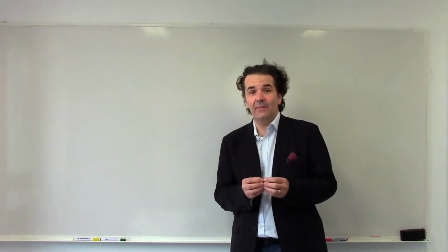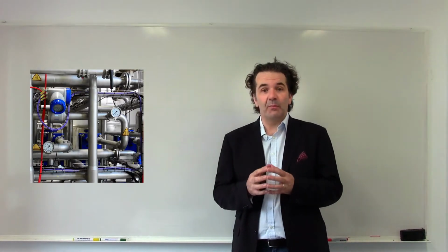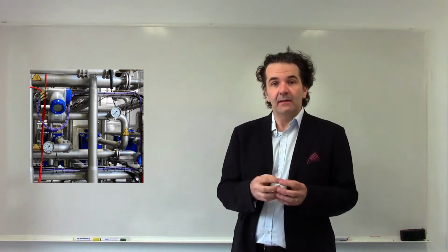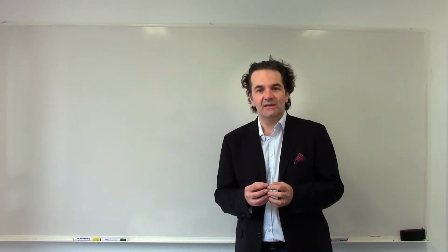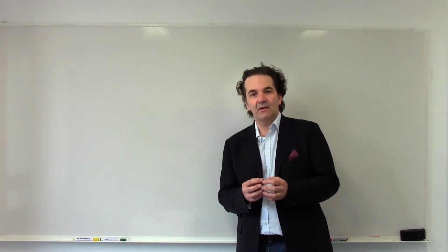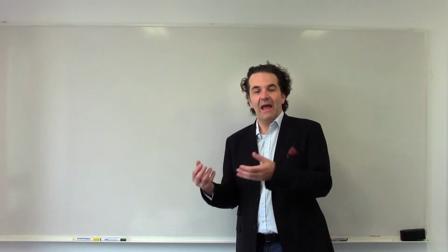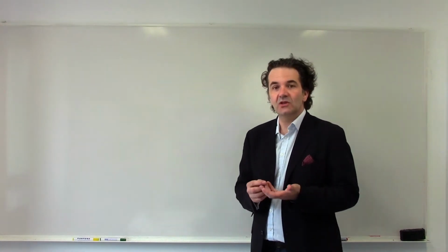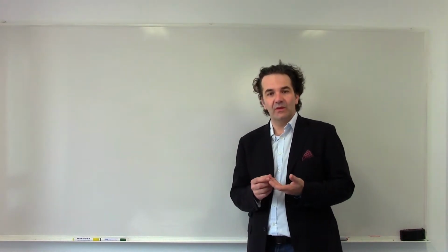Now, inline real-time measurements are like this manometer, which is delivering the pressure of the tube behind right now, right at the side. It is not always possible to take inline real-time measurements. Sometimes you have to take samples, carry them to the laboratory, make a protocol, take measurements, and you have a time gap between your process, which is of course developing during this measurement, and the knowledge what was going on in there. And our soniccatch improves this situation in enabling or improving the application of PAT probes within the process.